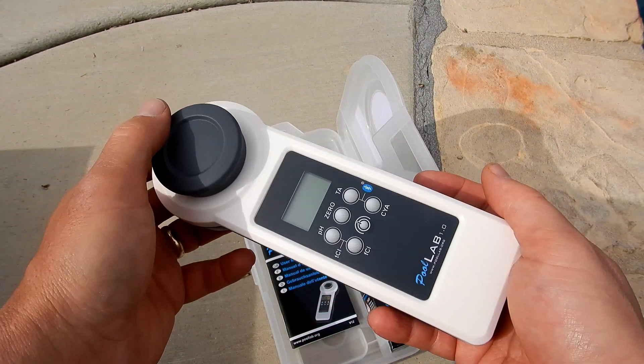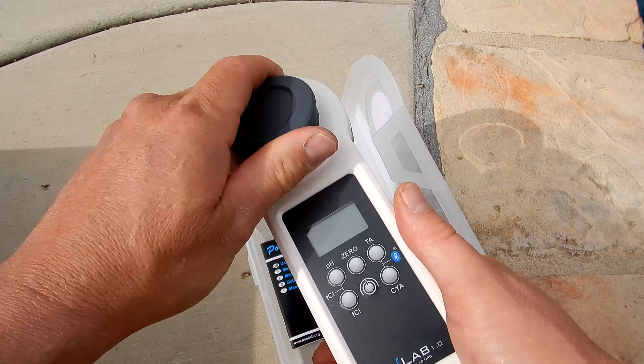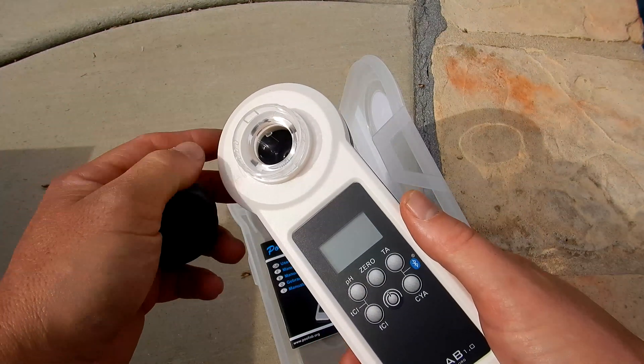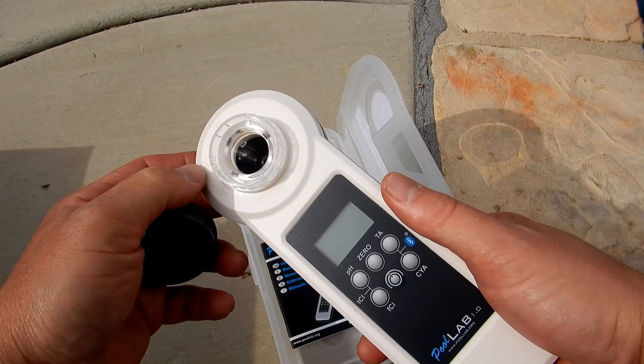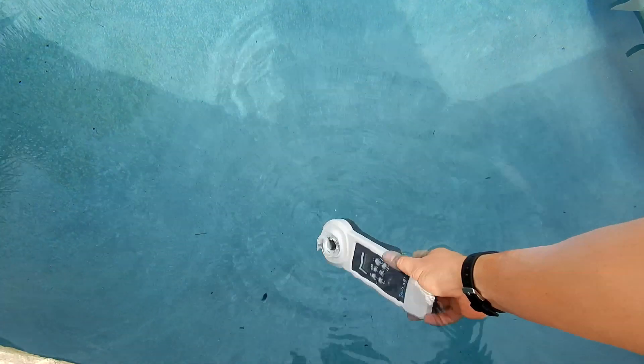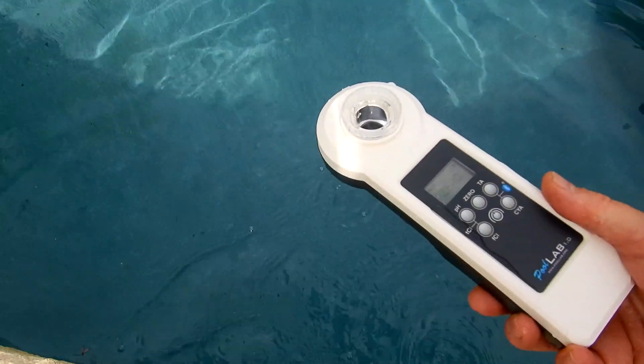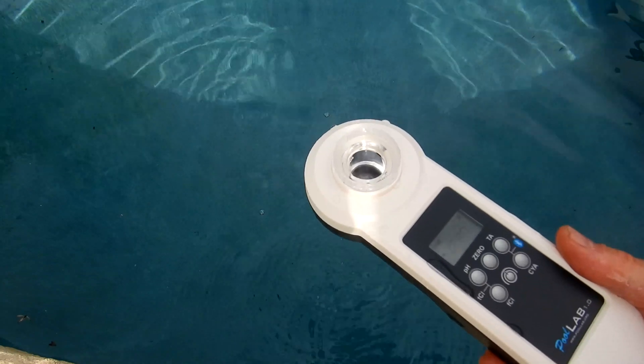What I really like about the PoolLab 1.0 is that it's completely waterproof. You're actually going to submerge the PoolLab 1.0 to get the 10 milliliter water sample for testing. You want to shake it out so you get the exact 10 ml. You can also use the syringe to get the water sample.